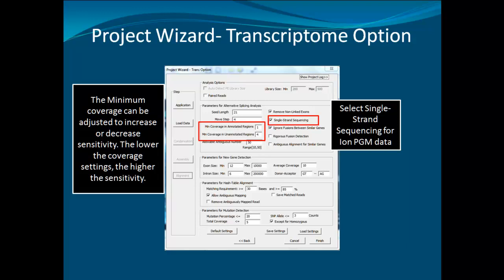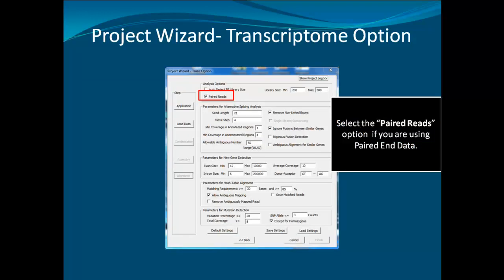The other settings can be left at default as they work well for most datasets. If using paired-end data, select paired reads. However, for Ion PGM paired-end data, it is recommended to use the Overlap Merger tool, which is discussed in the improved accuracy of Ion PGM paired-end data webinar. The single-strand sequencing option will be grayed out once paired reads is selected.